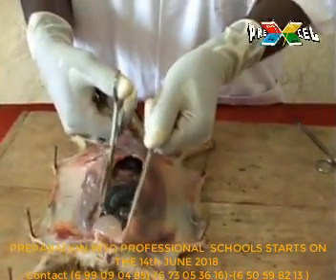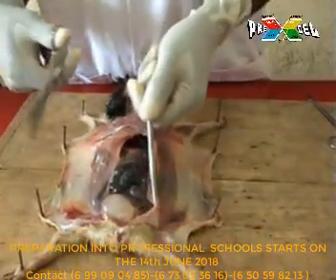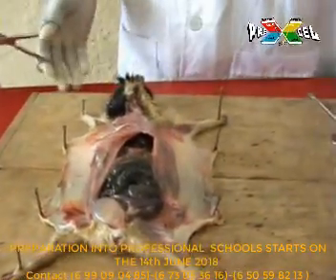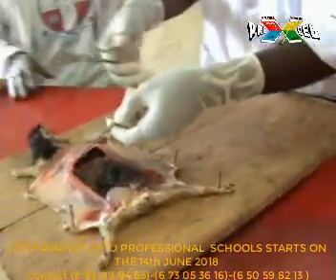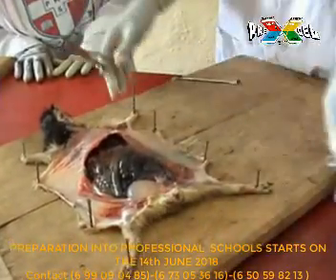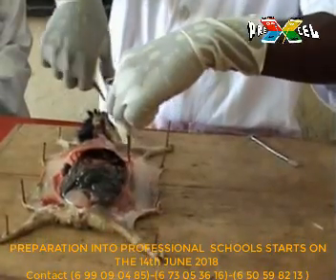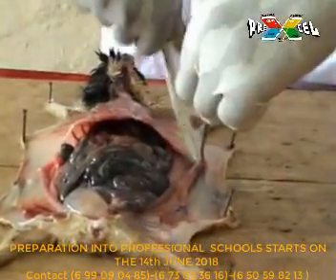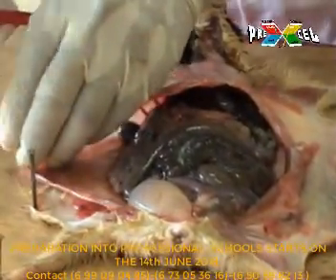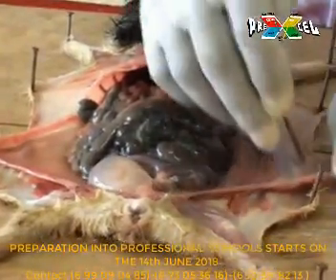Cut down towards the inner region, cut down like that, ending there. Cut again a little bit towards the leg, and also cut towards the other side. Then come up this way — do not cut towards the leg but cut down, noting the position of the ribs. Cut here along the ribs without destroying them. After cutting, pin this inner tissue again onto the board.